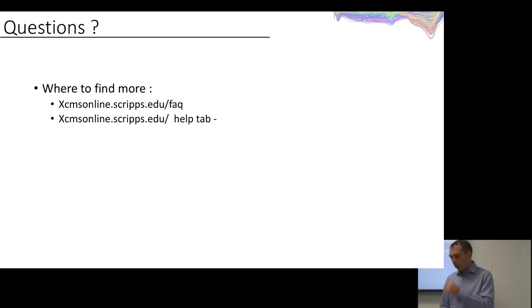So before I end, do we have any questions? And also, please remember that there's a wealth of more information on the XCMS Online Institute and on our FAQ site. Do we have any questions from our audience here? Erica, do we have any questions from online? We had one. I had Dr. Domingo help me answer it, but okay. We'll say it verbally as well.